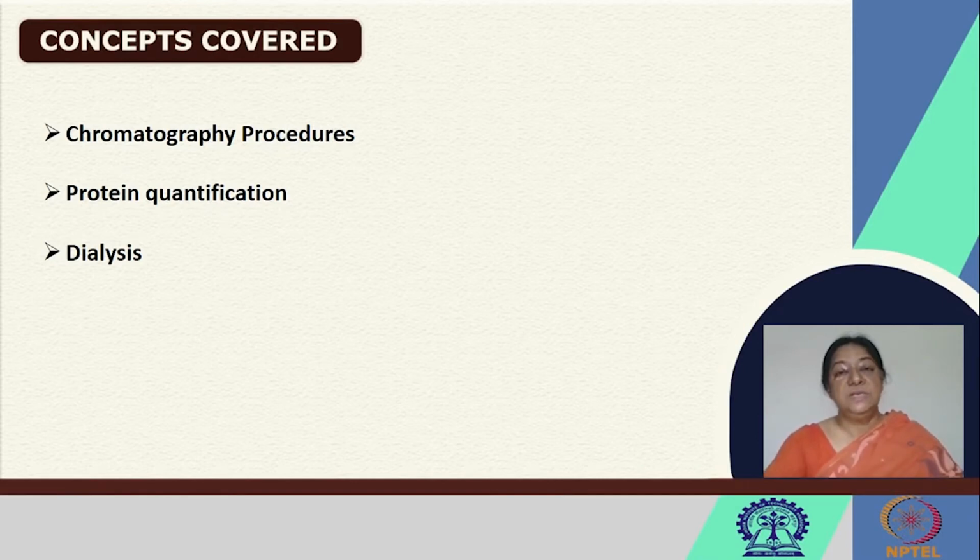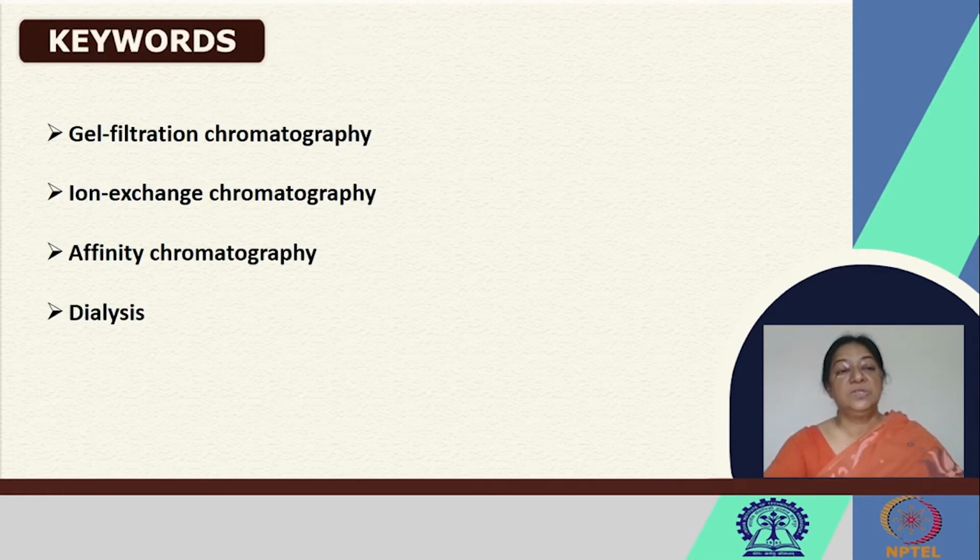Our interest is our protein, the specific tissue or the microorganism from which we are going to isolate this protein. And now we have a crude fraction of the protein. Our next idea is to look at this crude fraction and then, following a specific protocol, exploiting a specific property of the molecule, we are going to go for specific procedures to get to our final protein.